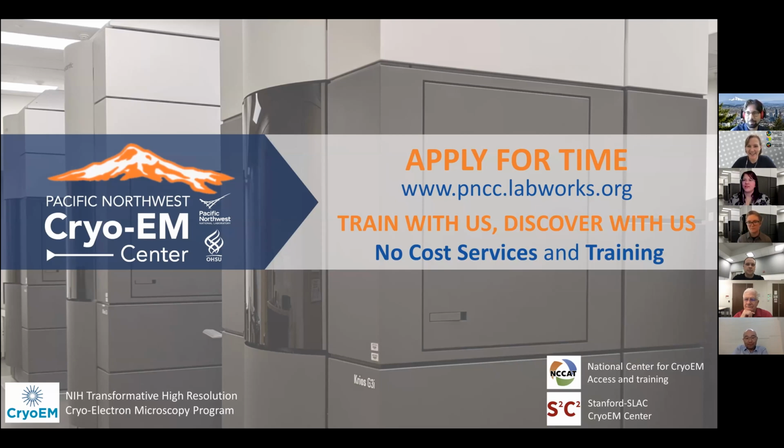So hello, everyone. My name is Lauren Hilsbeck, and I'm the project coordinator for Pacific Northwest CryoEM Center, PNCC. We're just going to go over a few things that we offer. We have 2 proposal types: a limited access proposal for preliminary data sets up to 24 hours, and a general access proposal for larger projects up to 480 hours a year for 2 years.